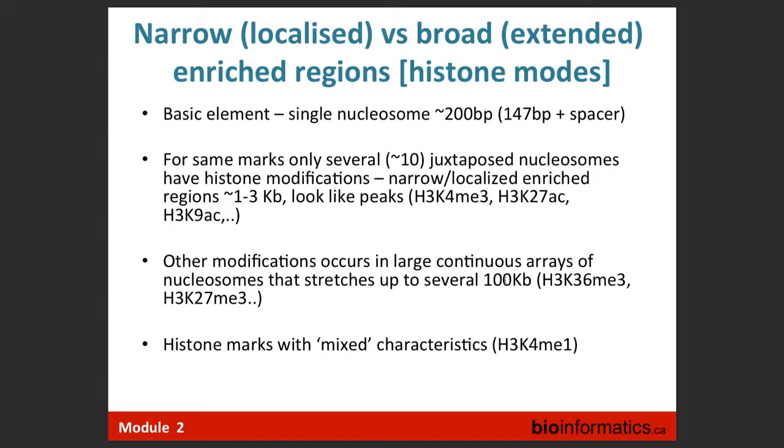I remember, yeah, it looks like that. If we have Poisson with low mean, it looks something like that, very asymmetrical. Now, when our mean is 50, say this our mean is 2. If our mean is 50, our Poisson will look almost like normal. So we can't really directly compare input, we need to do a lot of scaling. That's what all these peak callers do. They try to do something along this line, but not using input directly to determine the property of your background. Now I'm being very precise in what I'm saying.